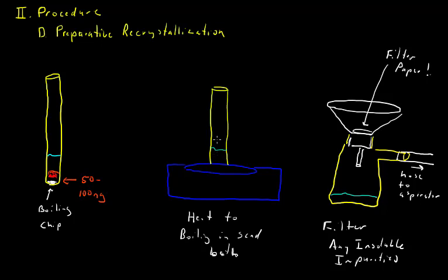Boil it with the activated carbon and filter the activated carbon out as you would insoluble impurities. So the filtration in that case is taking care of two things, getting out the activated carbon and removing any insoluble impurities. And so that's one way of getting rid, in some cases, of colored compounds, colored impurities from a solution.